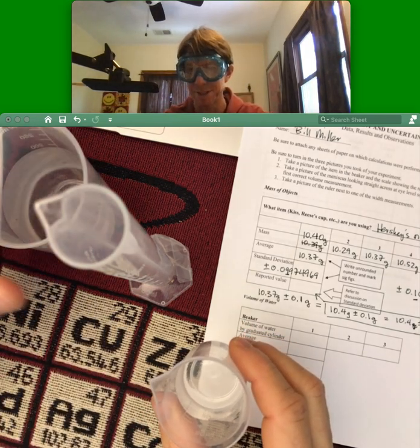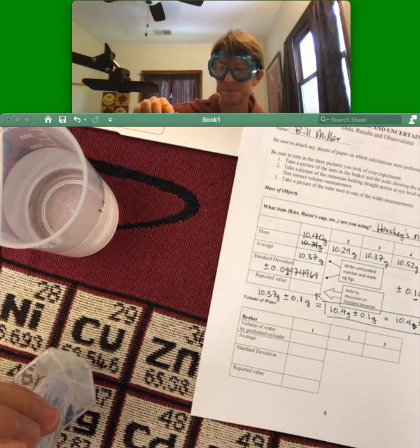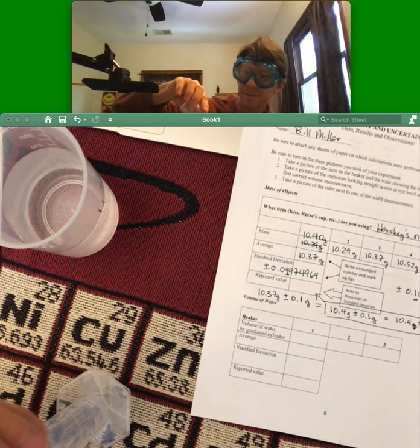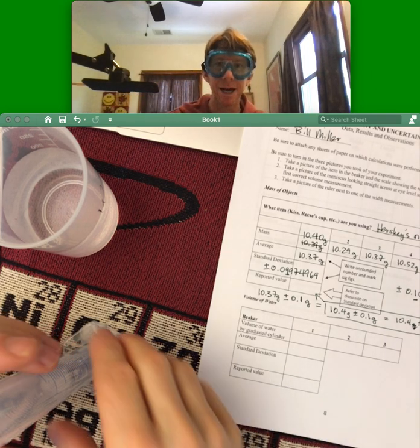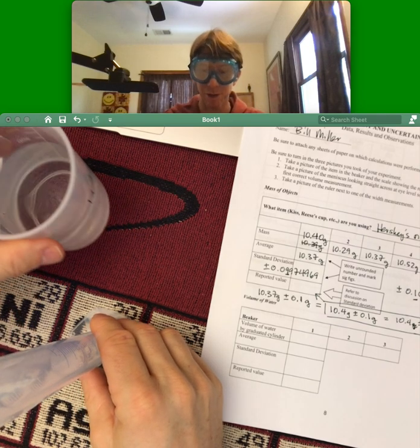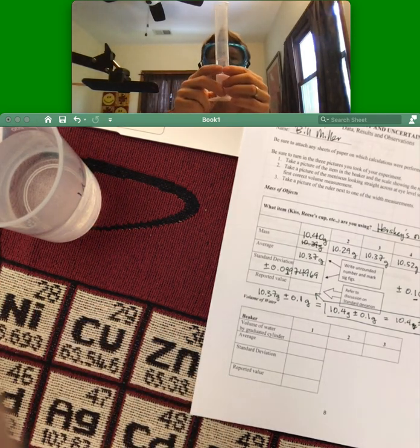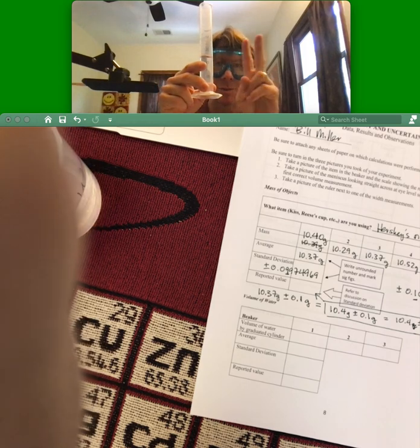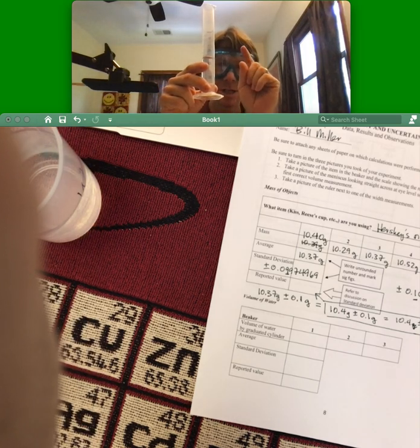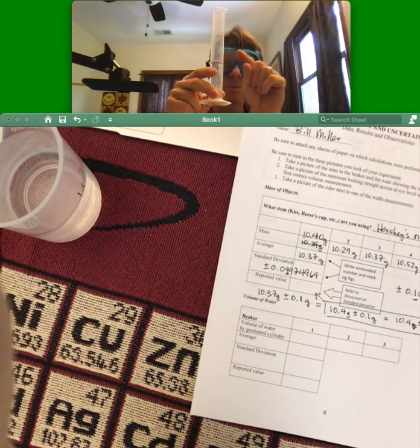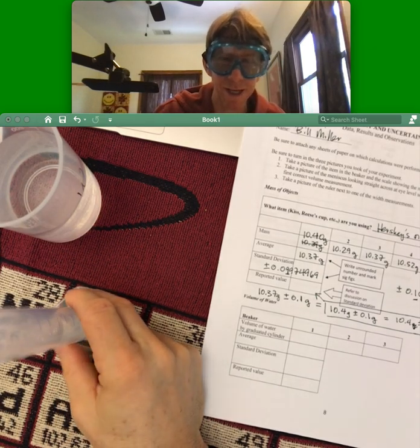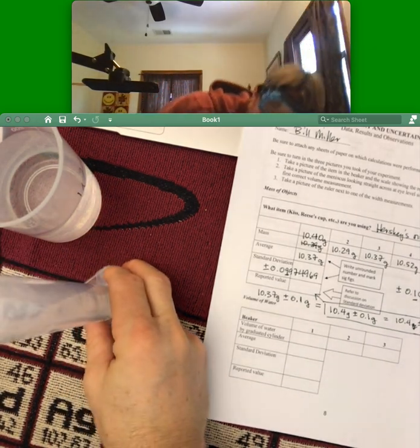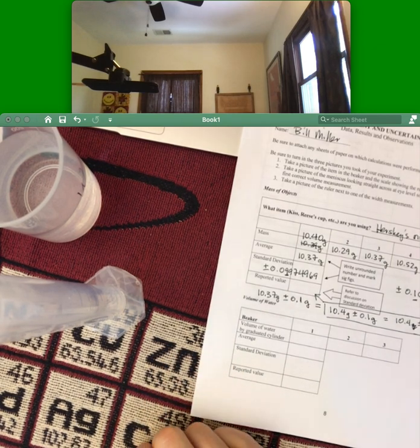And now I am going to pour it into here. And again, you have to look straight across if you are going to measure it. This one measures in one milliliter, so I am going to report my value to the 0.1 milliliters. And again, I apologize, I am going to disappear here for a minute. But I am going to get down. I am going to look straight across.